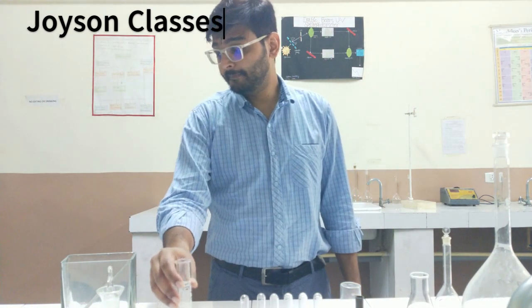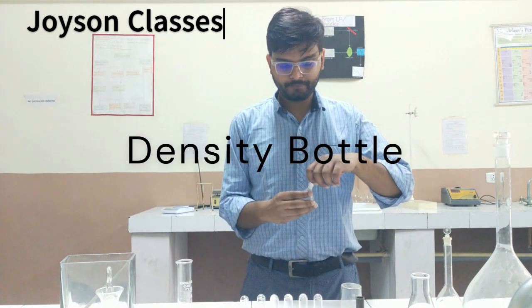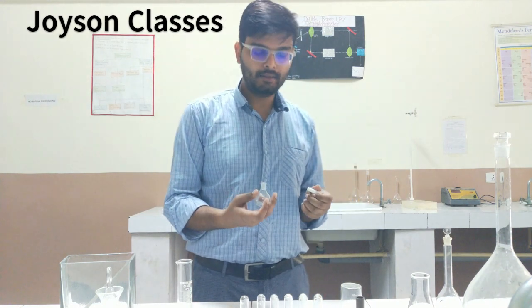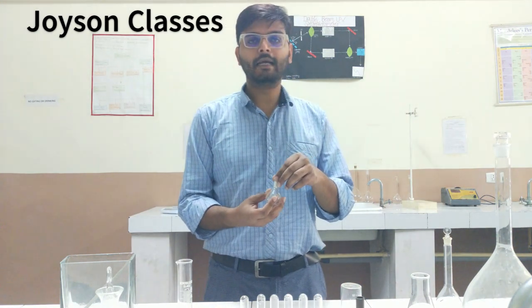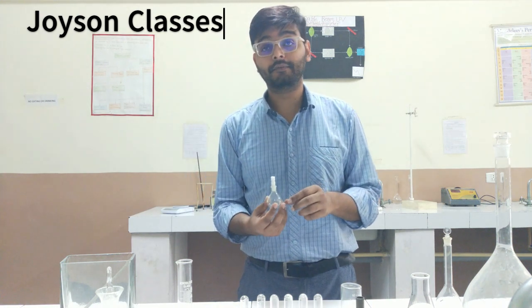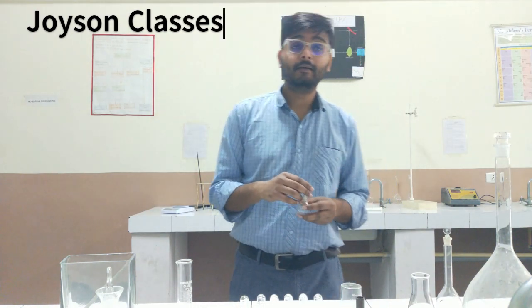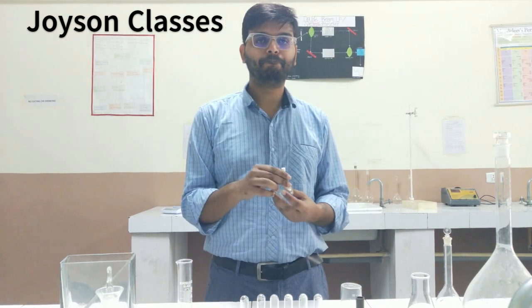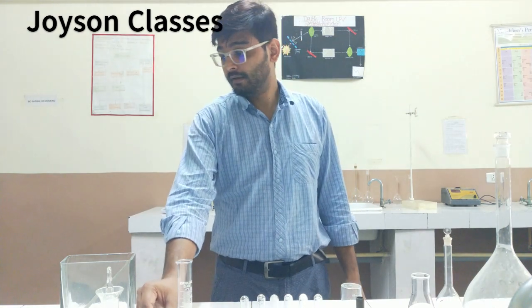Yeah. And next would be the density bottle. If you want to take the density of any liquid, the density formula is mass upon volume. If you want to find the density of any liquid chemical, then this would be the right thing. It is called the density bottle.